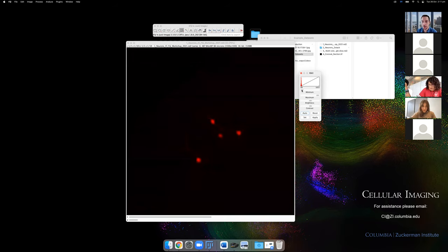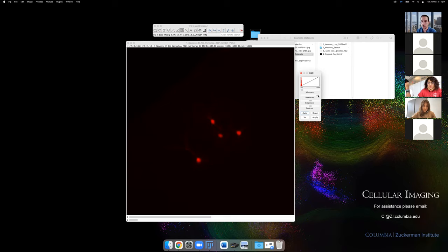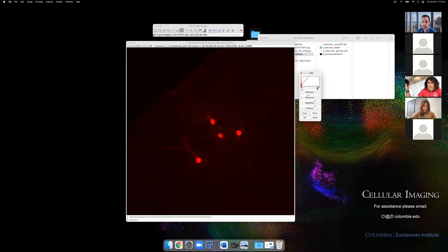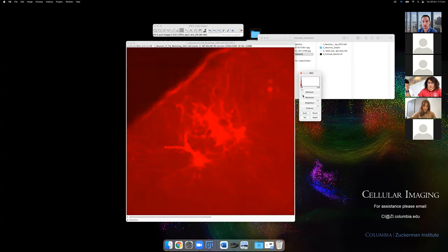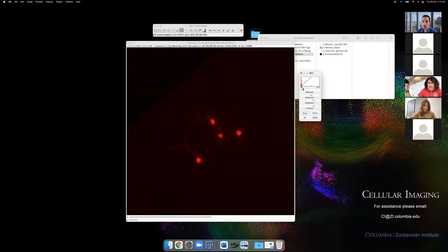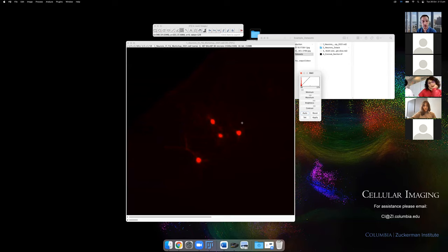The best way to think about brightness and contrast is to use the minimum and maximum sliders. The minimum brings up the black level — everything below this number goes to black. The maximum is the white level — everything above it becomes the maximum intensity. This gives you a really clear idea of what you're doing to the data; you can adjust these to remove background and add contrast without actually altering the underlying data.